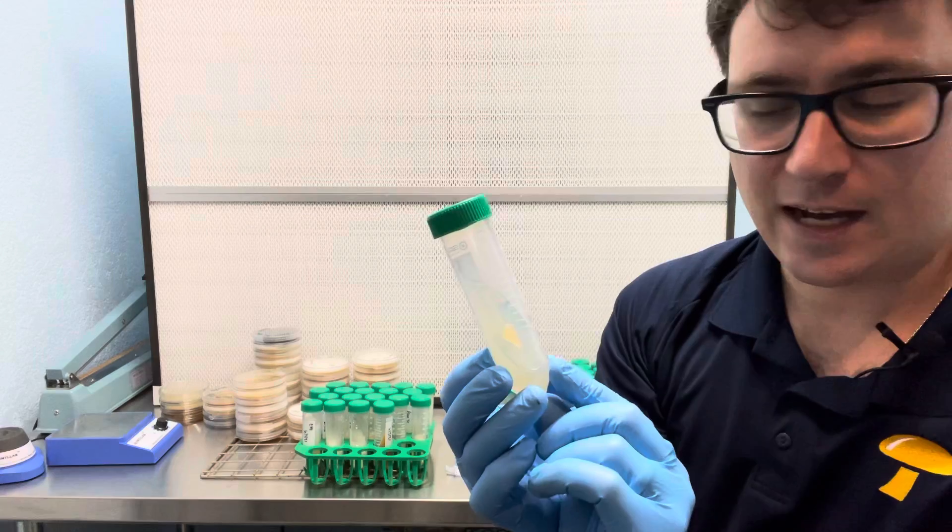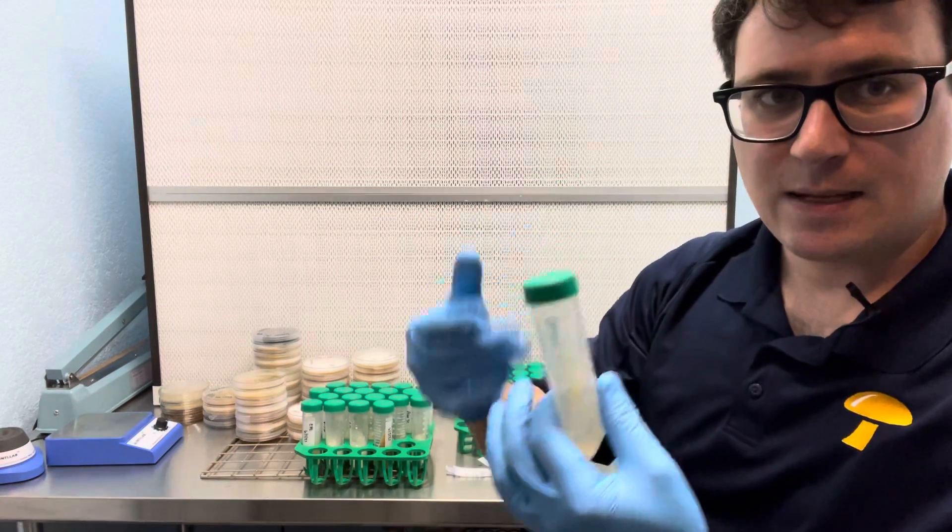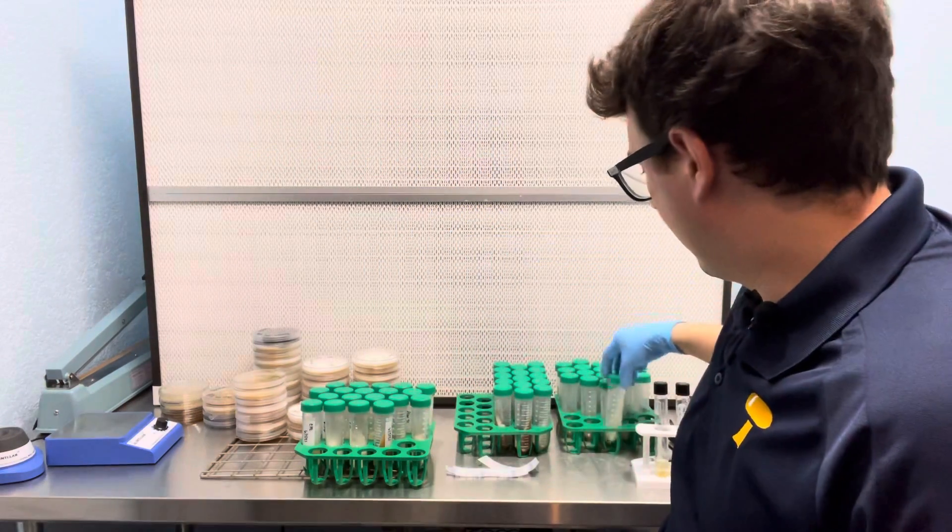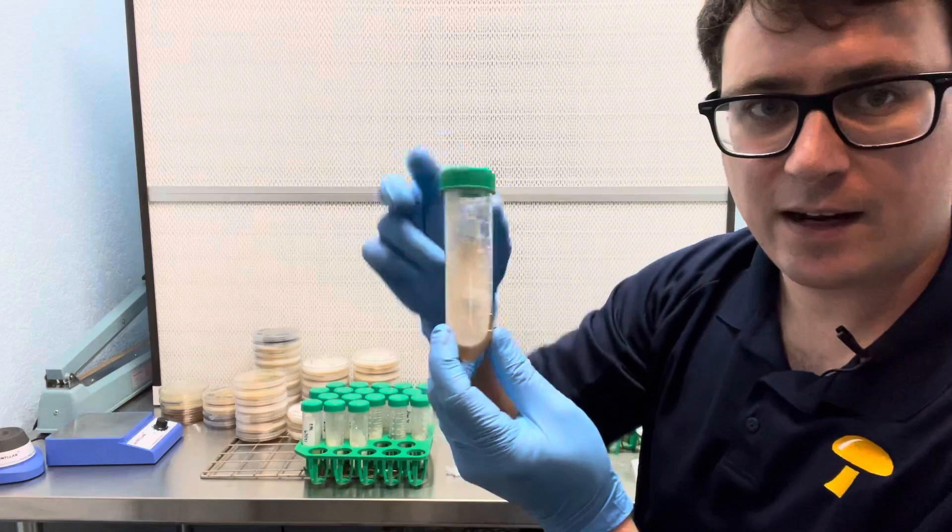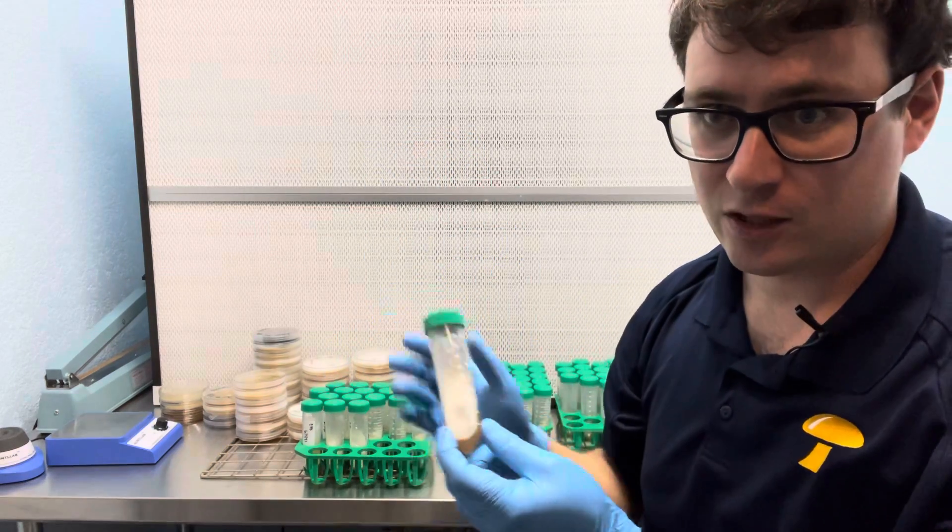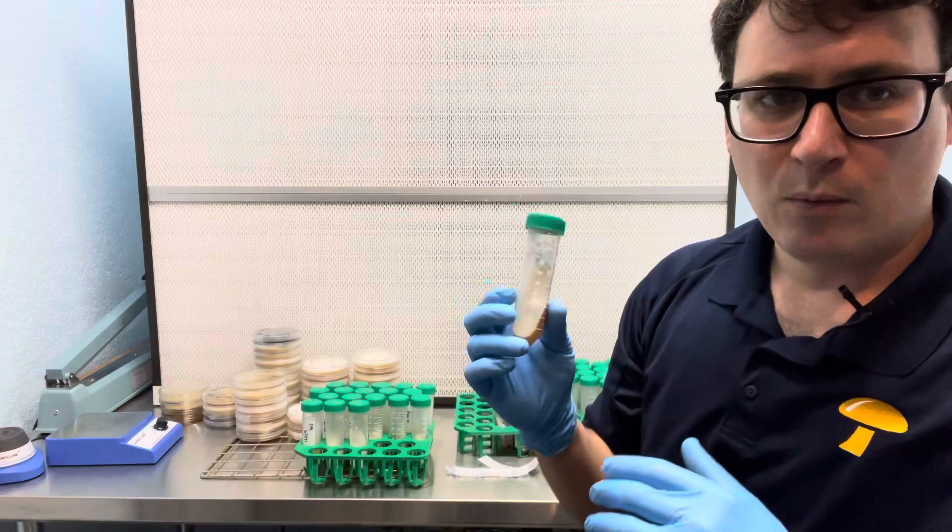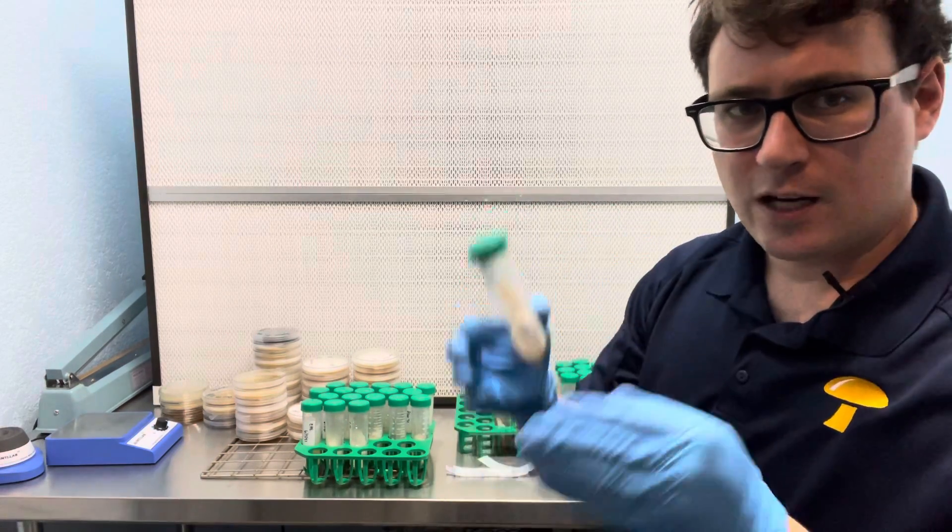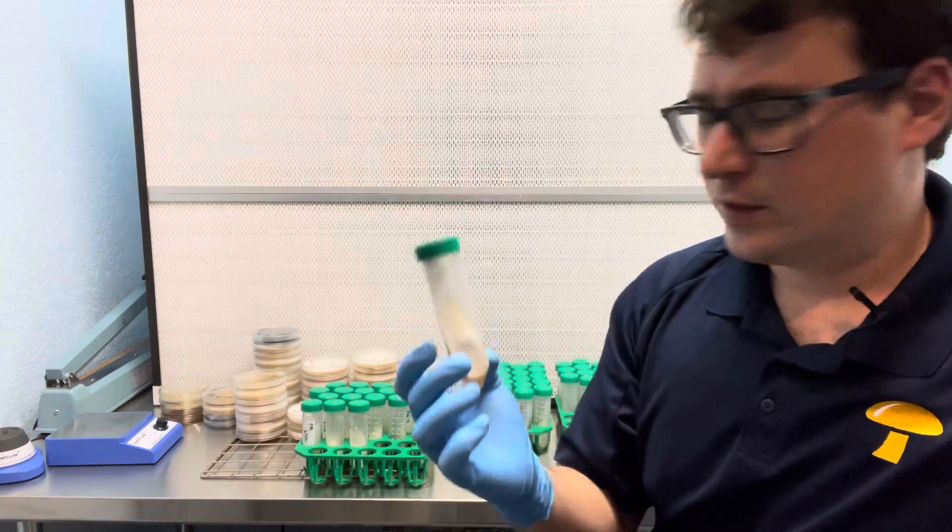So this is potato dextrose agar. I usually rotate between malt extract and potato dextrose when I'm doing my long-term storage. So you can see this one here is on malt extract so I would go ahead and put this one onto potato dextrose and that just kind of keeps the mycelium more vigorous. It keeps it healthier by switching up the nutrients so it doesn't get used to the same food source.